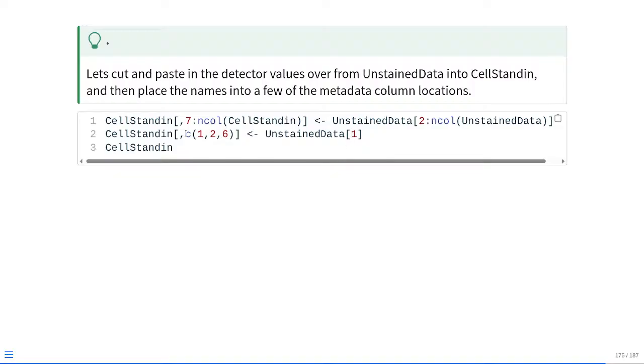We can just have it written into place for a couple of the metadata columns that we would expect for the single colors. So at this point in time, the correct background has been copied into place for that first part. So now UV1 through whatever R8 detector are correct. And then instead of empty values, you see name now has a particular value, fluorophore, and negative, corresponding to the name we had provided for that negative background across the board.